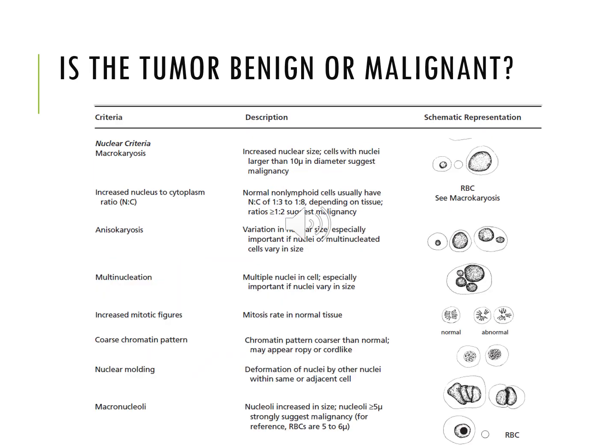This slide just covers some more criteria of malignancy that we look at. This is mostly for your reference, and I'll discuss them in greater detail on the next slide when there are pictures and it's easier for me to describe things to you.